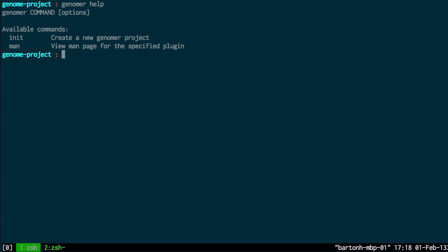First of all though, I typed genomer help to list the commands I have available to use genomer. Init I just used to create a new genomer project and man shows the man pages for specific plugins and commands.